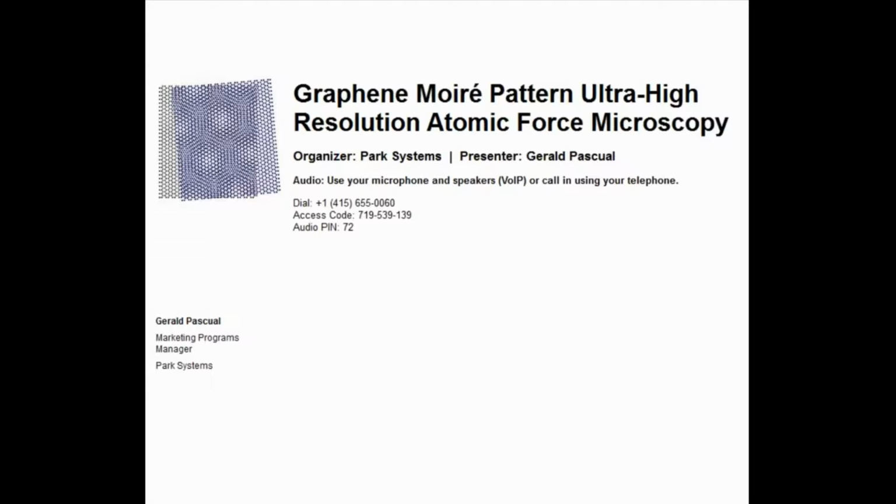Today we are giving a presentation on an interesting research project that we recently presented at the Physics and Chemistry of Surfaces and Interfaces conference in New Mexico, actually the other week. It is based on graphene Moiré pattern ultra-high resolution atomic force microscopy.